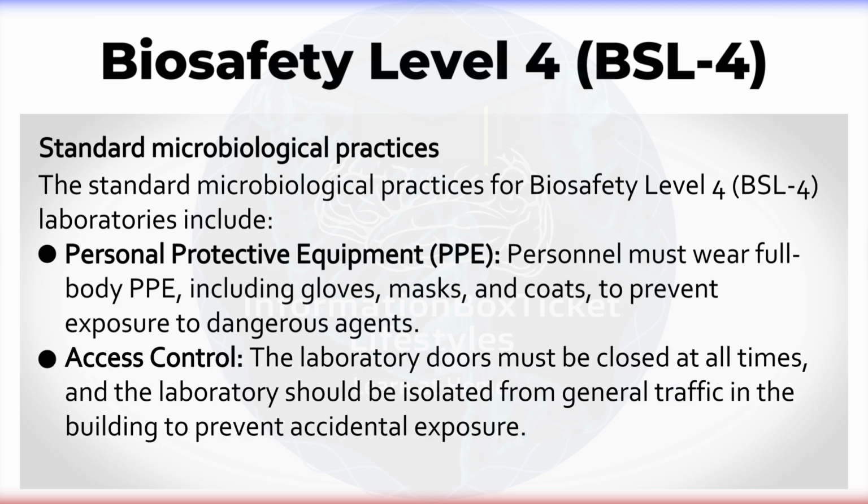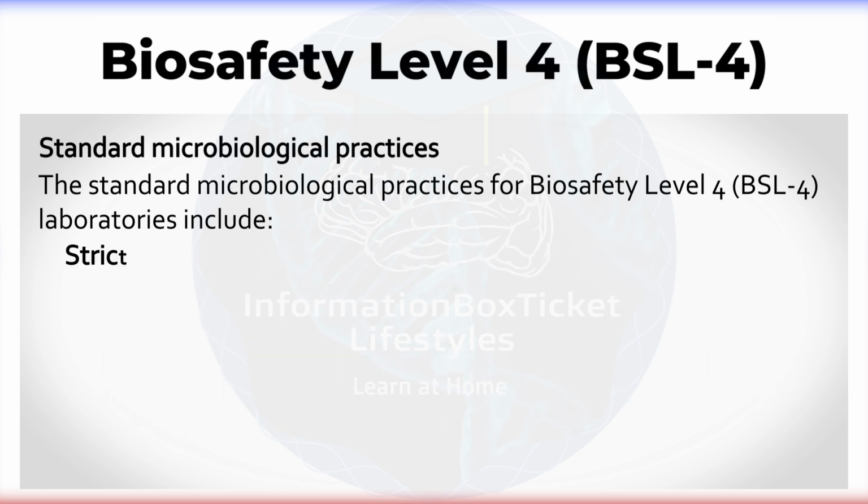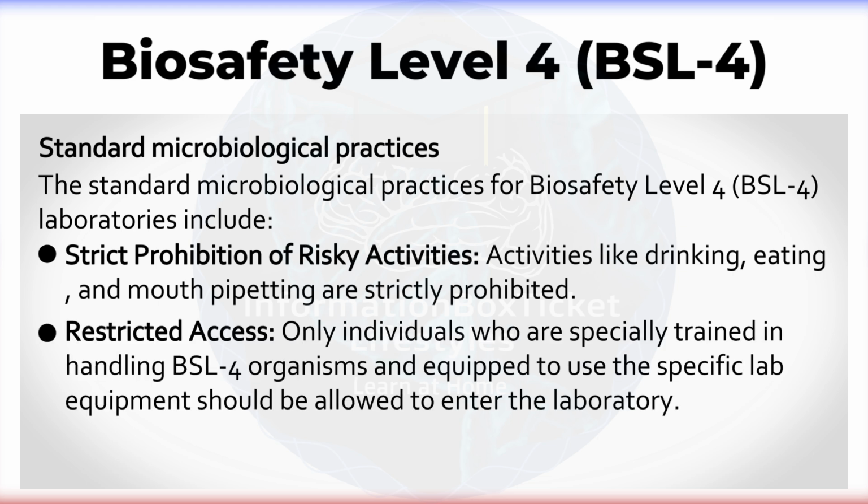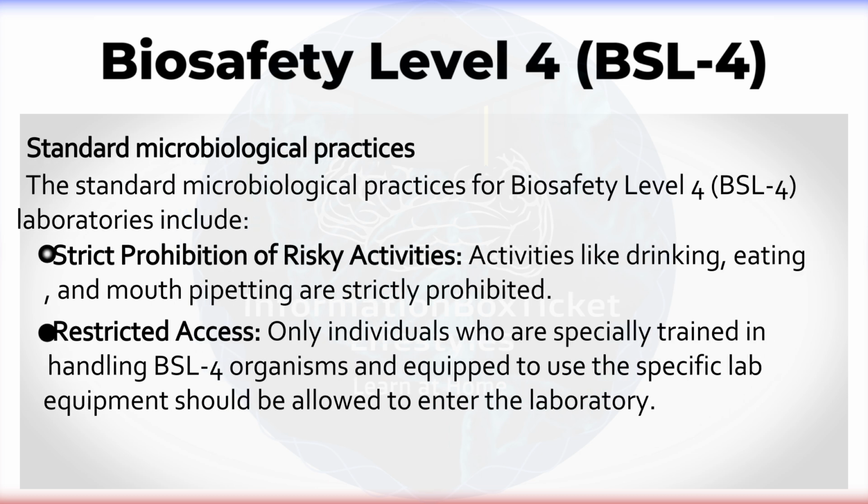Access control. The laboratory doors must be closed at all times, and the laboratory should be isolated from general traffic in the building to prevent accidental exposure. Strict prohibition of risky activities. Activities like drinking, eating, and mouth pipetting are strictly prohibited. Restricted access. Only individuals who are specially trained in handling BSL-4 organisms and equipped to use the specific lab equipment should be allowed to enter the laboratory.